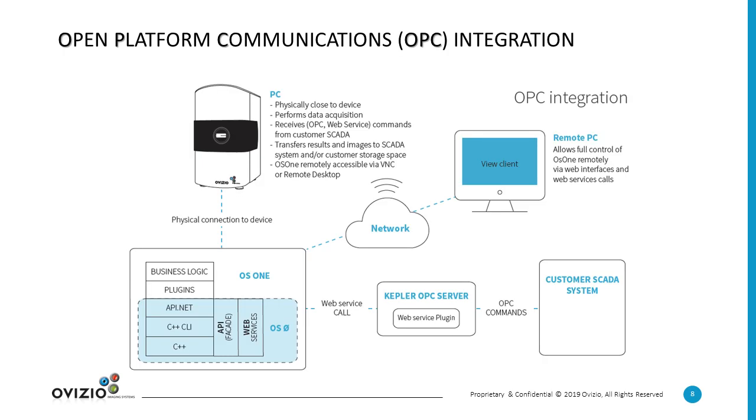The main setup that we use to communicate with other platforms and with other software and servers and SCADA systems is OPC. I won't go into much detail around this, so if you have questions on OPC, feel free to contact me afterwards.